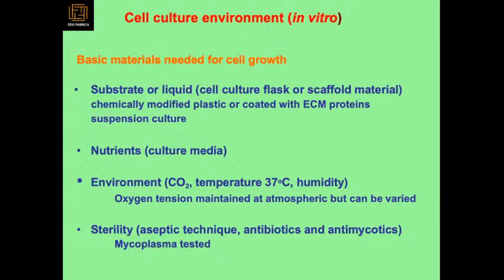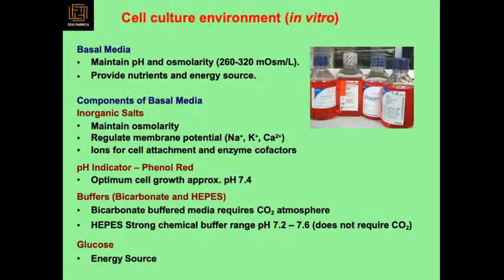Then you should have nutrients with culture medium. The environment has to be maintained inside the chamber with carbon dioxide, temperature, and humidity. Then sterility has to be there, aseptic techniques, antibiotics, antimycotics have to be added into your samples. Have a regular check of mycoplasma also. So this is the very basics for the cell culture environment if you are growing cells in vitro.